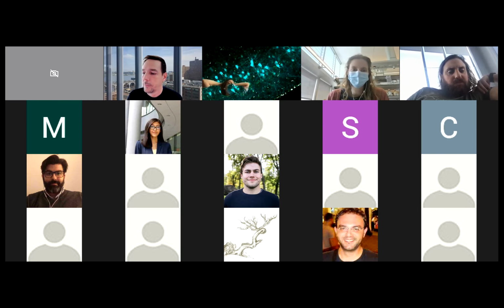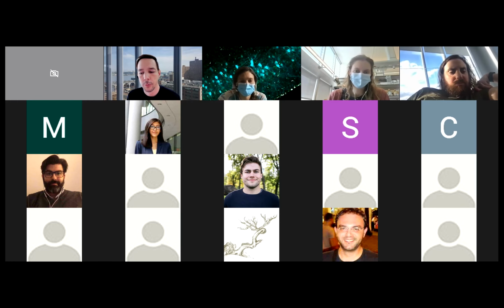Yeah, and in terms of the microscope, they don't share the architecture of what they're doing, but it's basically a convnet for image segmentation, like a UNet, most likely. But it works really well. We've been able to train it already quite well, and I think with some effort it's going to be better than using Ilastik, and it's faster. I didn't mention, but Ilastik is about 20 seconds per channel per image, which isn't bad, but if you have 300 sections, that's a bit of time. It's like 2 to 3 seconds, I think, for the deep learning segmentation. So it's much faster and better.